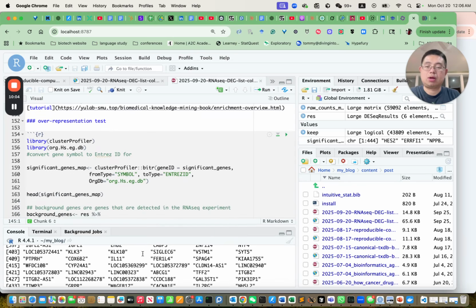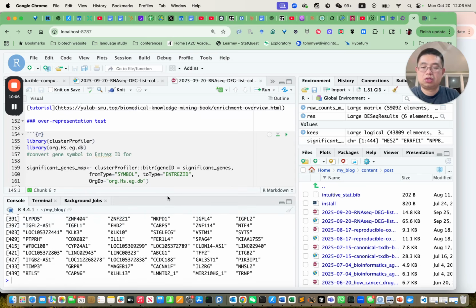So essentially you have the number of genes that you define as differentially expressed, and then you have multiple pathways that are human curated, and each gene set has a certain number of genes. Then essentially it's just a hypergeometric test, because you have this many genes that are differentially expressed, and then how many of those genes are in a certain gene set, and you can just calculate that with a hypergeometric test.